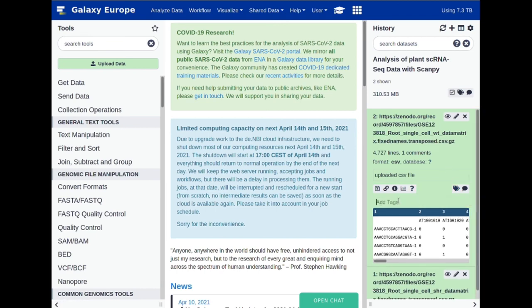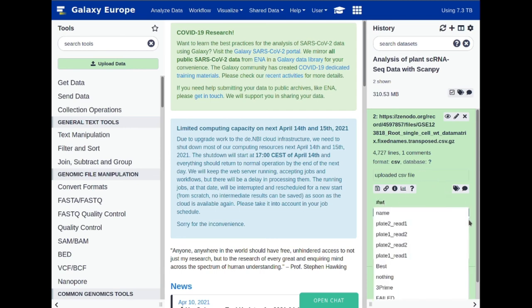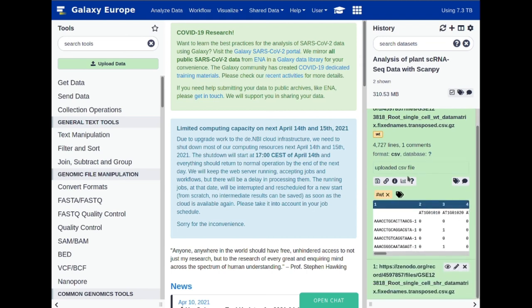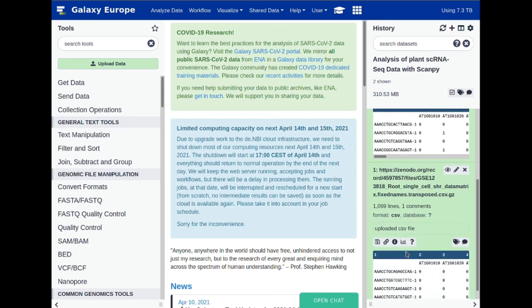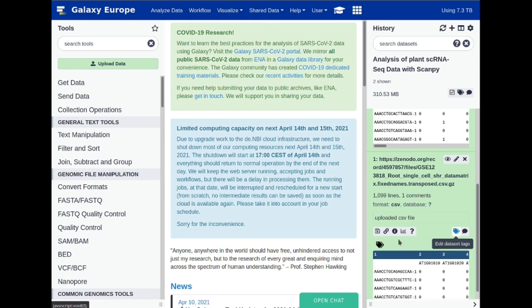There we go — we have the WT tag and '#WT' will be inherited. If we go down and click on the second dataset, it might take some time to expand due to the size of the dataset. This behavior is particular to this dataset and we will work on fixing it in the future. It is very important that you have these inheritance tags added — it makes the analysis much easier to understand. For the second dataset, click on 'Edit Dataset Tags', add '#SHR', click away and it should update shortly.